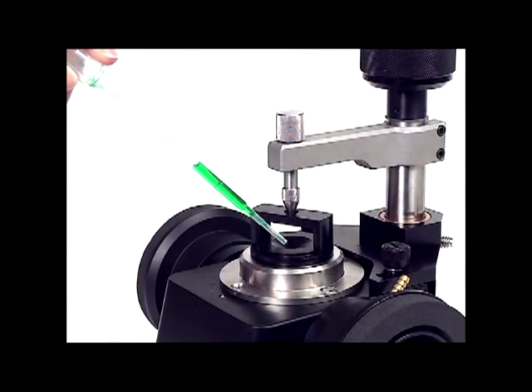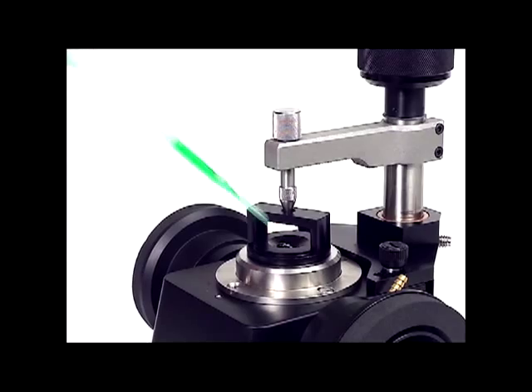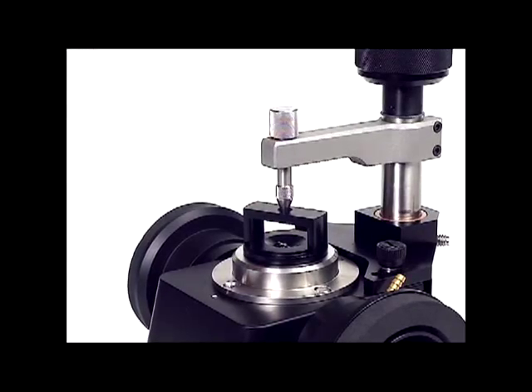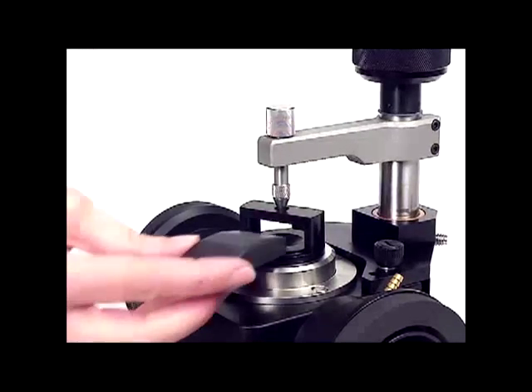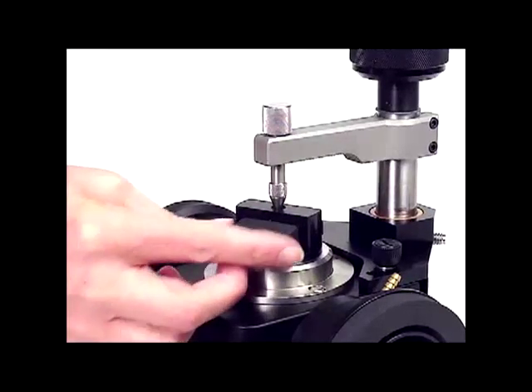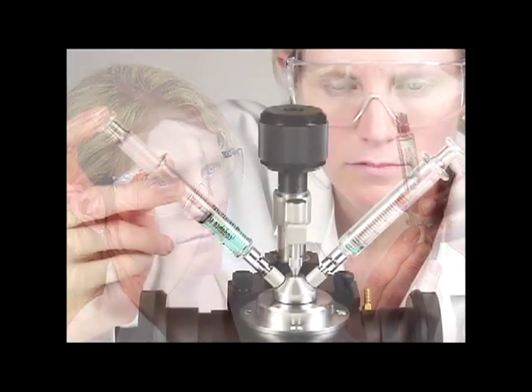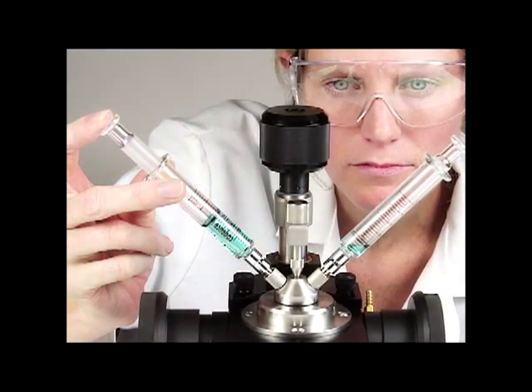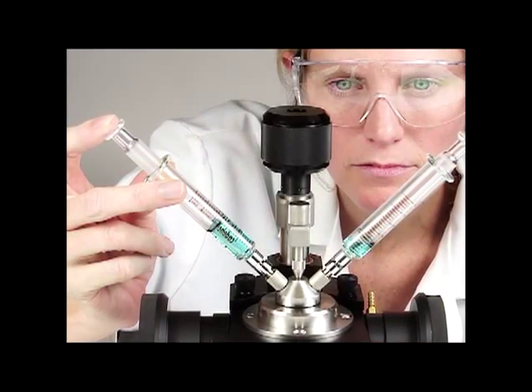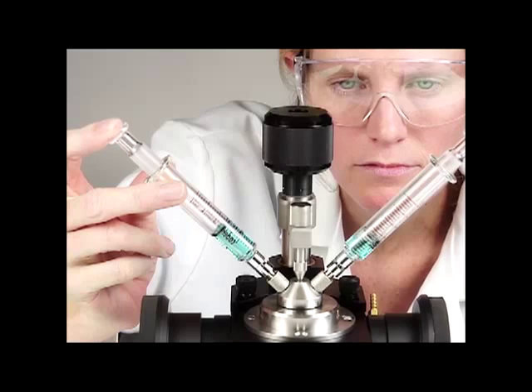The liquids retainer and volatiles cover for volatile samples. For noxious or air-sensitive liquids, fit your MIRacle with a flow cell.